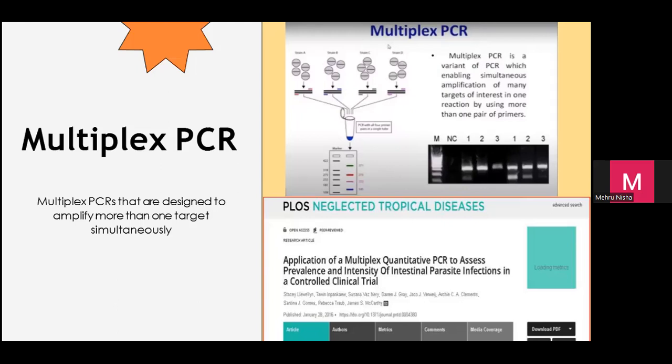Okay. Sekarang student may tanya untuk apa kita guna ni doktor? Kalau tengok yang single nested, dia akan ambil masa yang lama. Sebab kalau you ada ascaris saja you boleh buat. Lepas tu you dah habis ascaris, kena extract, kena guna mesin untuk hookworm pula.